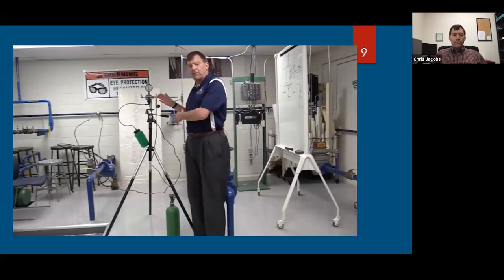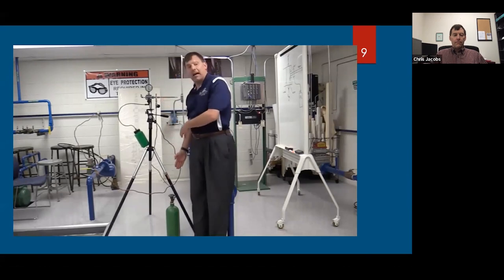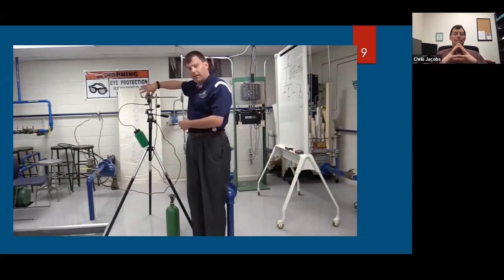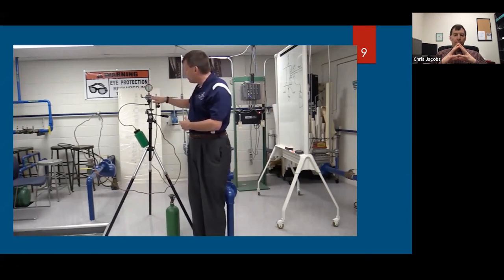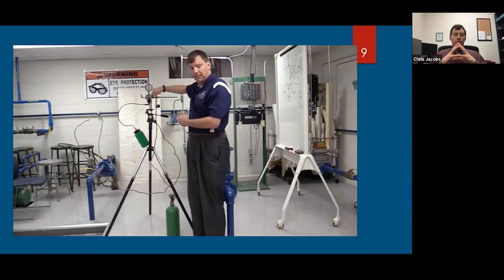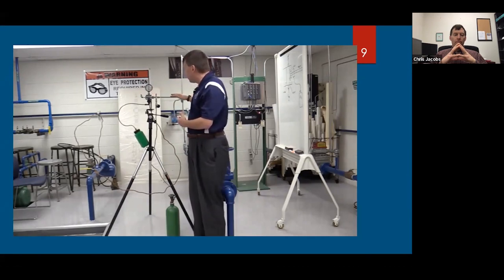So this is the Bureau of Mines dew point tester that we talked about earlier. The carbon dioxide tank that we are using as our refrigerant is down here. This is the chamber that I mentioned where the gas is actually going to flow through the inside of this chamber. This is the outlet valve. This over here is the observation mirror. This is how we're going to determine if there is condensation on the chamber mirror, which is inside the chamber. And again, this is our thermometer.